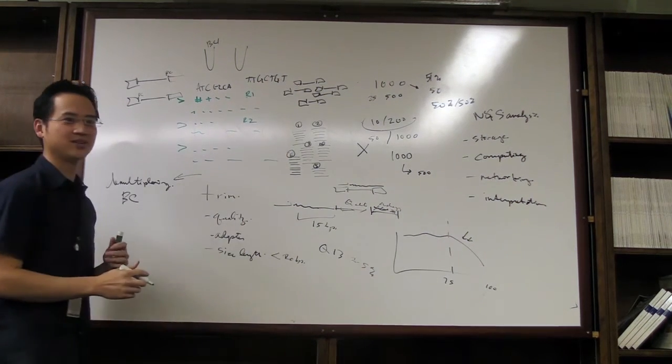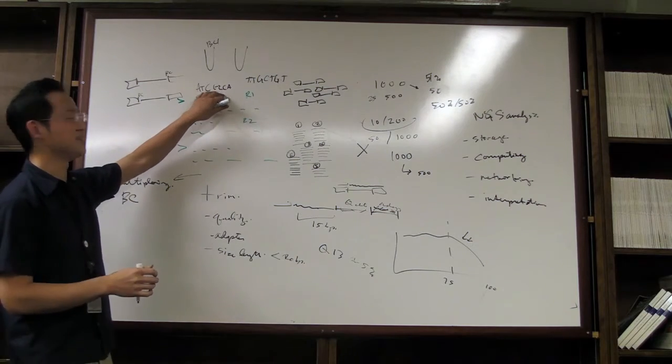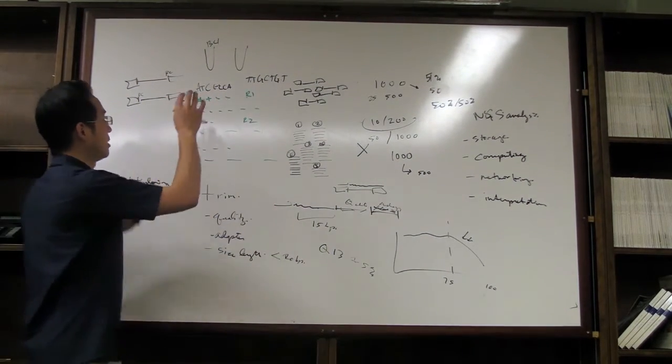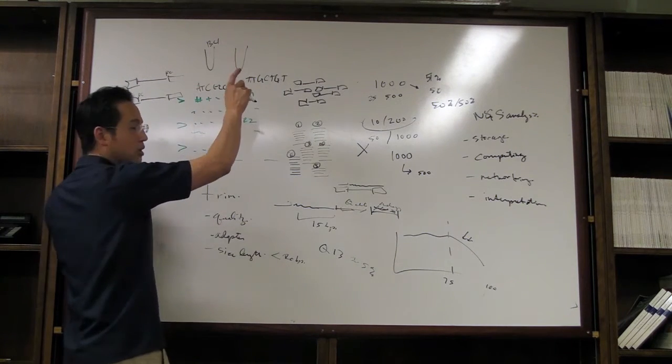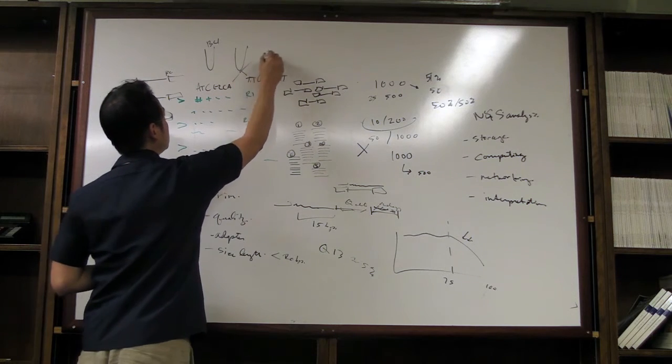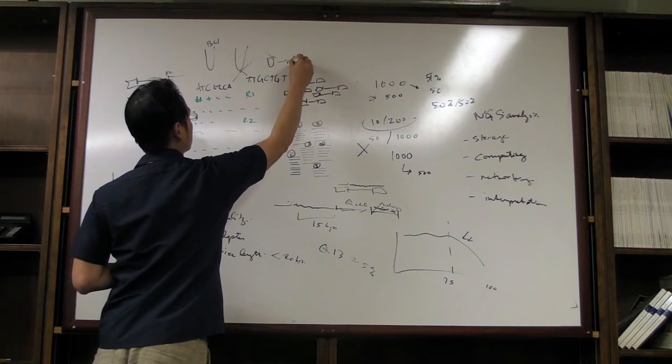There, that's different enough. So it tells you that these need to be unique and different enough that you can distinguish the two. So you would do their library construction and capture separately, and in the end qPCR and then mix the two together into one tube, and this is what you're going to take to do sequencing.